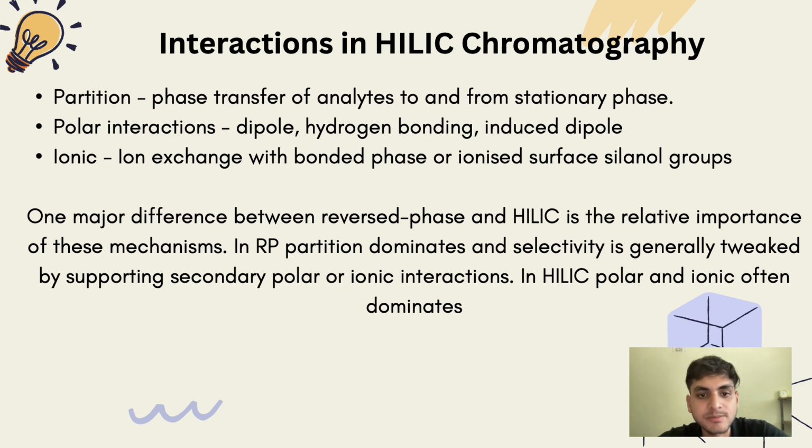There is one major difference between reversed phase and HILIC, which is the relative importance of these mechanisms. In reversed phase, partition dominates and selectivity is generally tweaked by supporting secondary polar or ionic interactions. In HILIC, polar and ionic interactions often dominate.